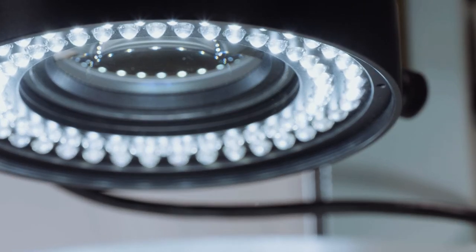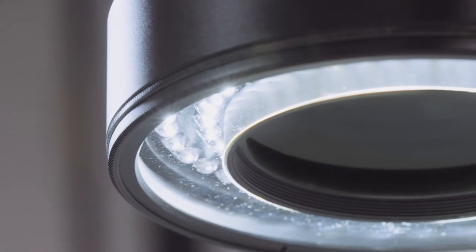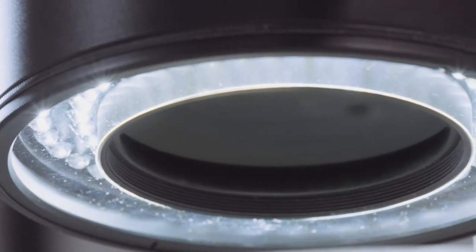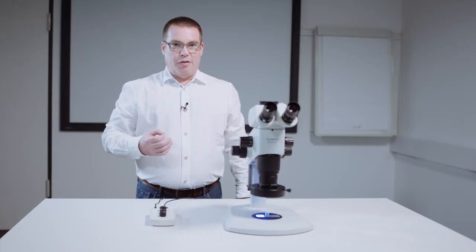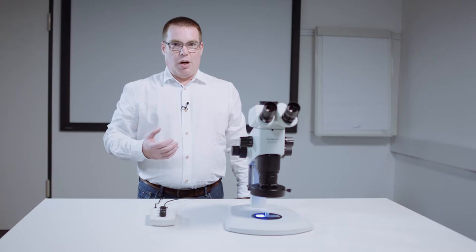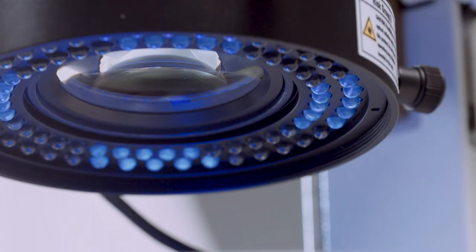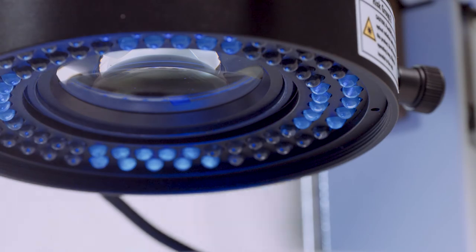Classic ring light brightfield illumination uses white light LEDs that emit light in the visible range. UV light on the other hand is below the visible wavelength, but excites many materials to visible fluorescence. Our UV ring light combines both illumination methods, as the controller can switch elegantly between normal brightfield and UV excitation.